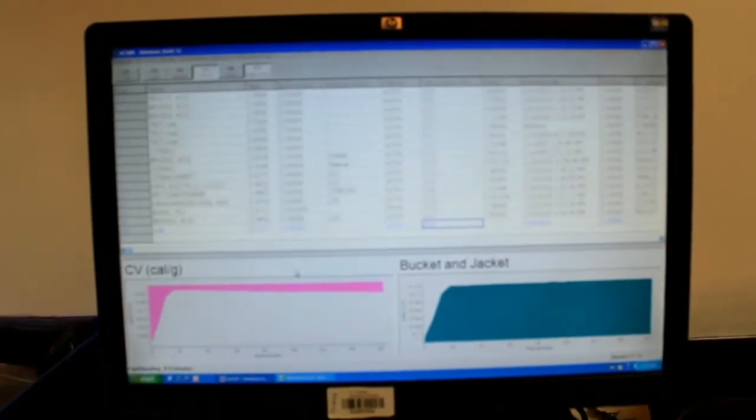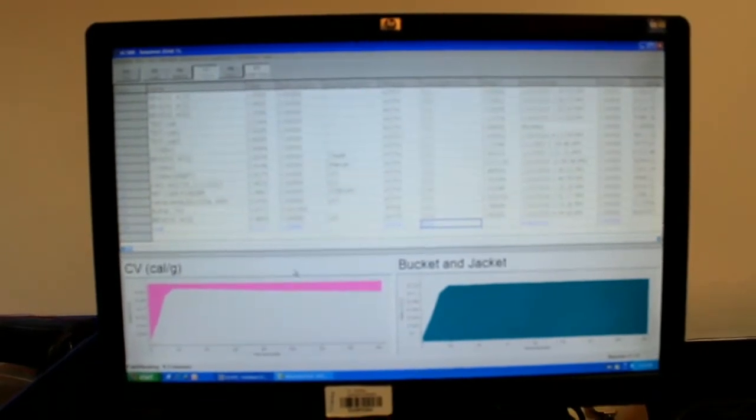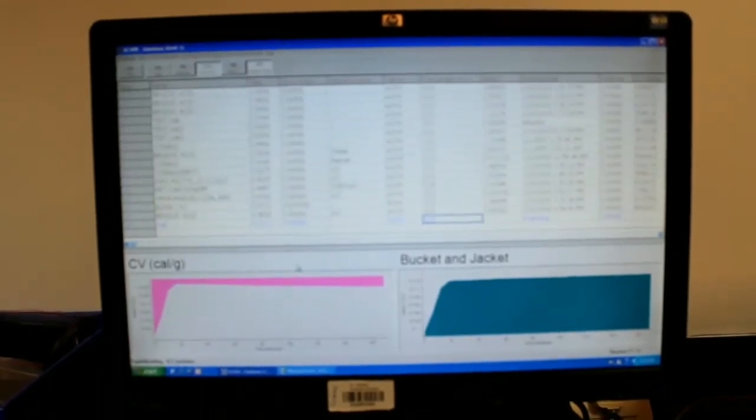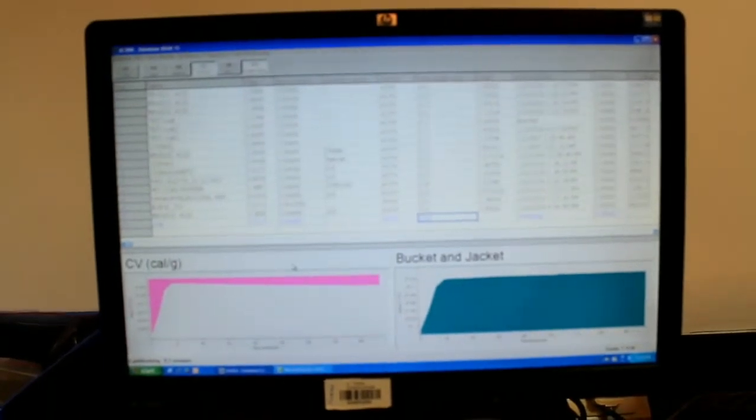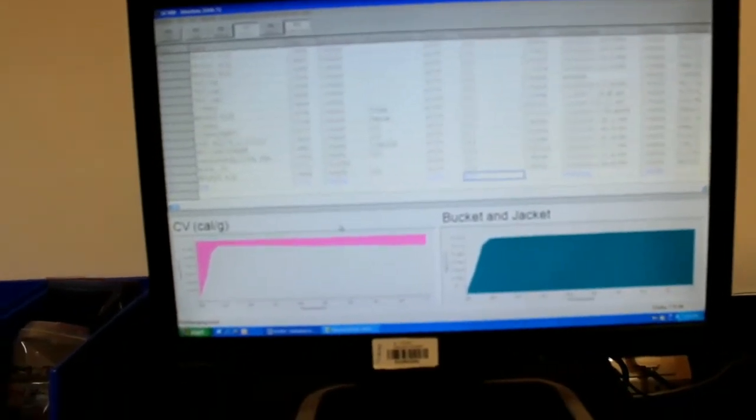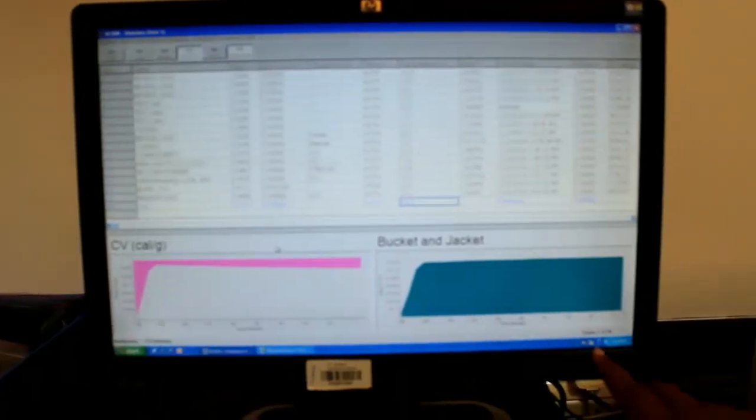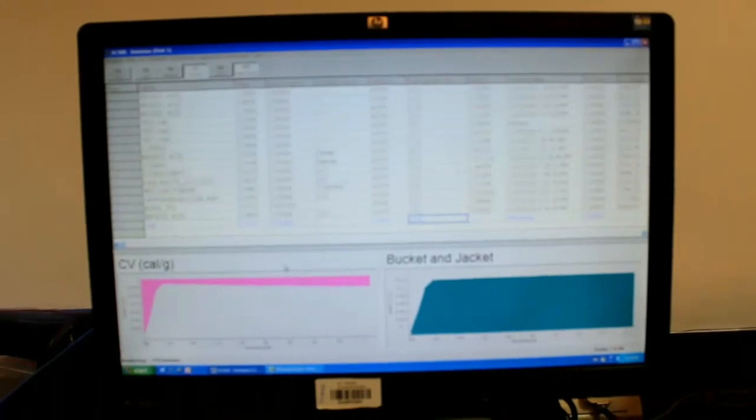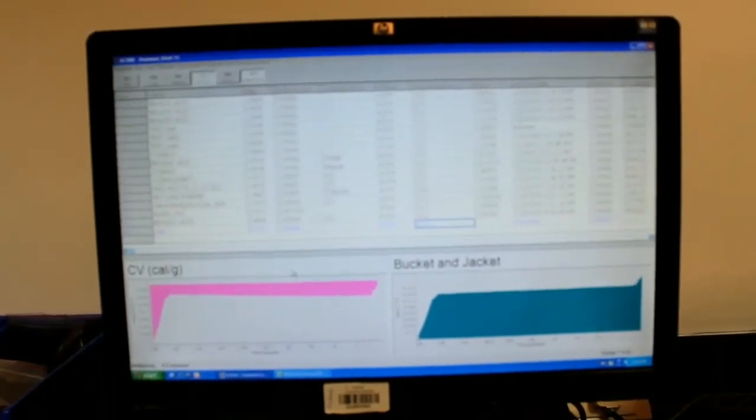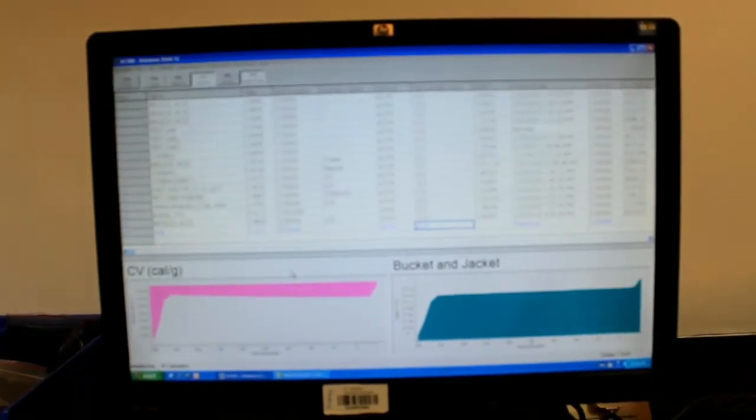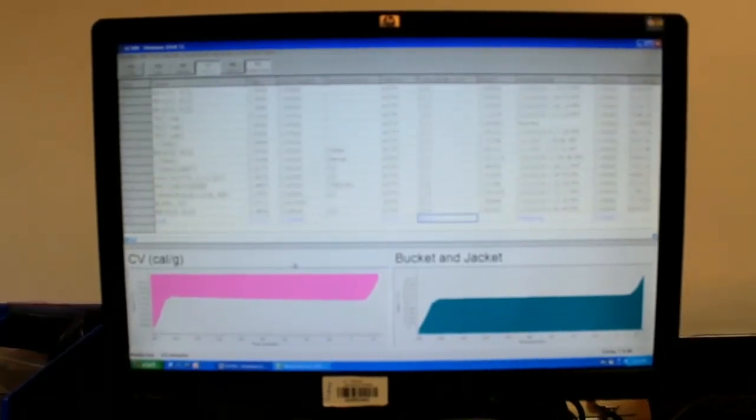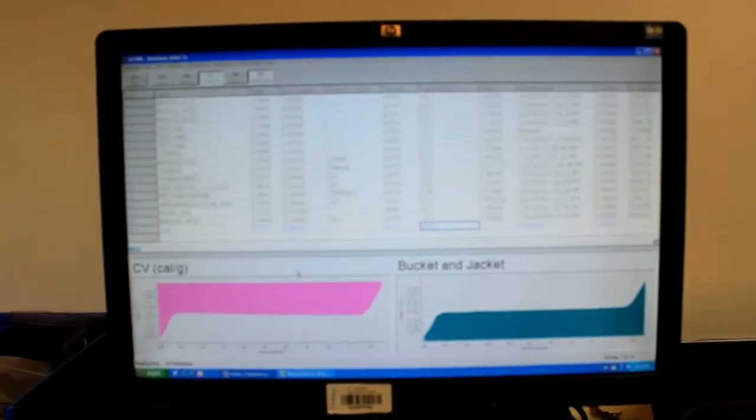Once this 3 minutes is completed, the analyzing time is 5 minutes. This is the precision mode of working. So the 3 minutes is over now. Now you can observe there, discharge the fuse. It means the fire has happened. So delta T, you can observe here, delta T. Now the delta T will rise according to the temperature of the water in the bucket. You see, now it is rising. In the figure also, you can check in the graph. Delta T is rising. Delta T is nothing but change in temperature. This is the fundamental of changing of temperature between initial to final.